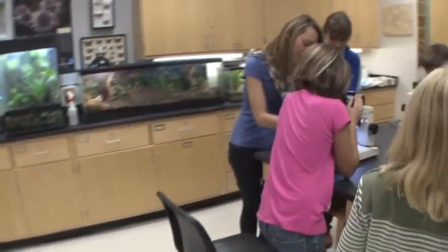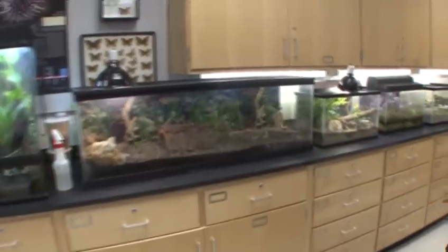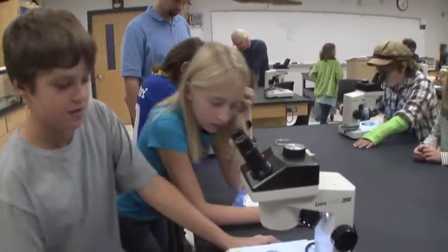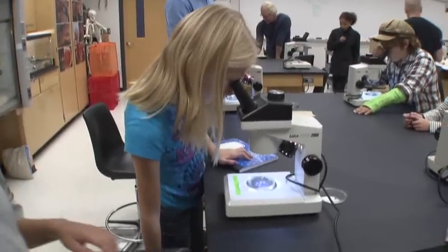And then there's a chiton over here, and actually in this scope over here, there's a chiton that's flipped over. And when you play with the light, it reacts a little bit, and so you can see it squinch up a little and straighten back out. I put that on that page because I thought maybe you'd see one of these. You think? Here, let's move the chair down.